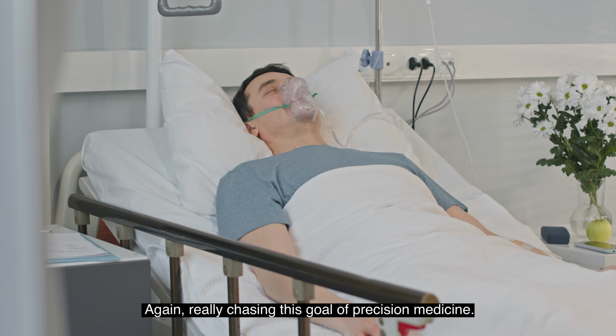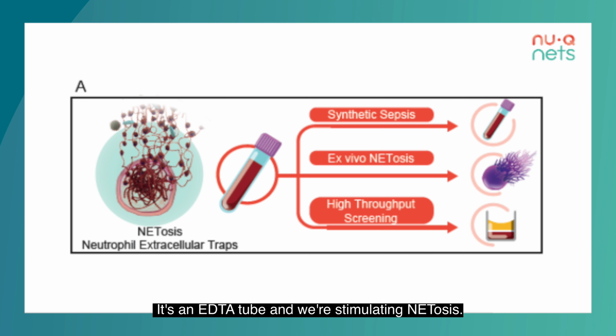What I'd like to do now is take you through one of the first papers published by the Innovation Lab. It's just been accepted in the Journal of Thrombosis and Haemostasis, and we're really grateful to Kieran and Terry and the team for all the work they've put into this. This is just panel A. It's really covering ground we've covered before. It's an EDTA tube, and we're stimulating NETosis.